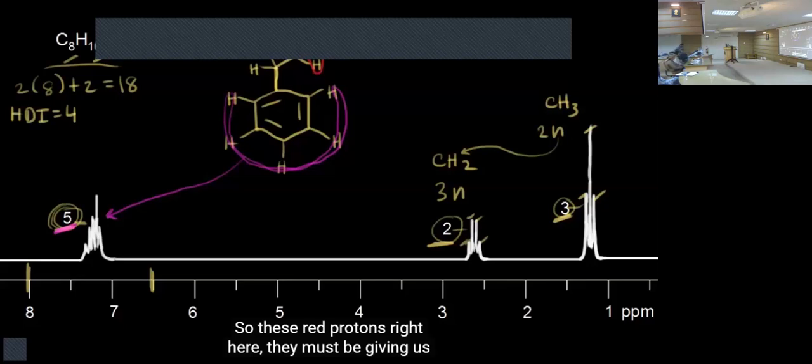Okay, so whenever you have this spectrum, looking at the triplet, this is the 3 proton. From the integration, this. Integration is the first thing you do while processing. So these are the 3 protons, a triplet. But triplet means this signal is a triplet because of the n+1 rule. So triplet means it has 2 protons beside it. So 2 + 1, that is why it's 3.